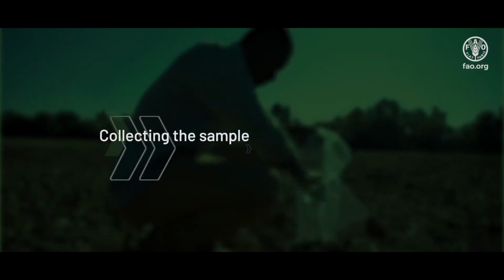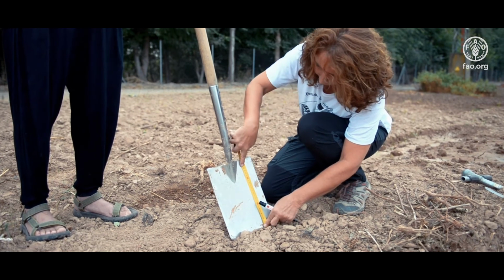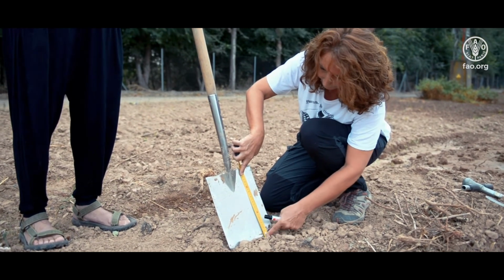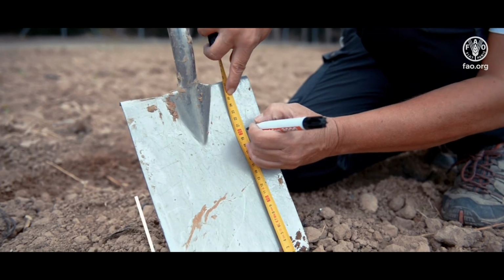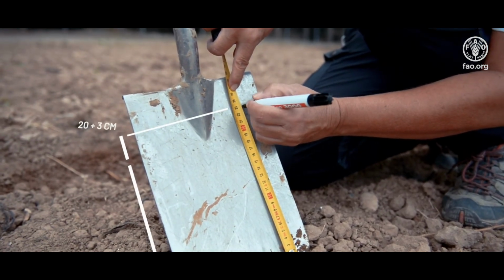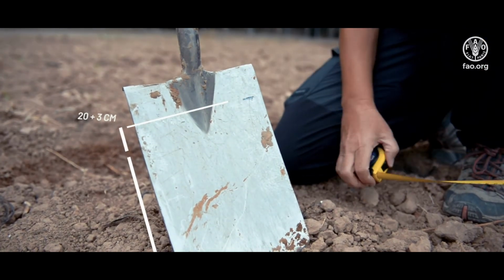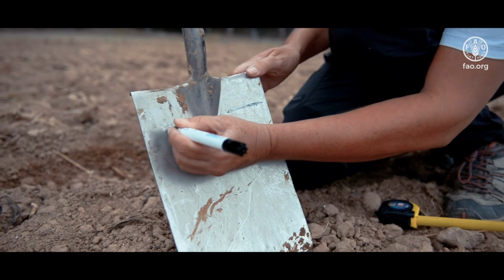Here we will show how to take a sample with the shovel. The first step is to ensure that we will take a sample at the same depth in all the points, in this case 0 to 20 centimeters. Therefore, we should mark the 20 centimeters plus around an additional 3 centimeters on the shovel to take into account the shovel inclination.